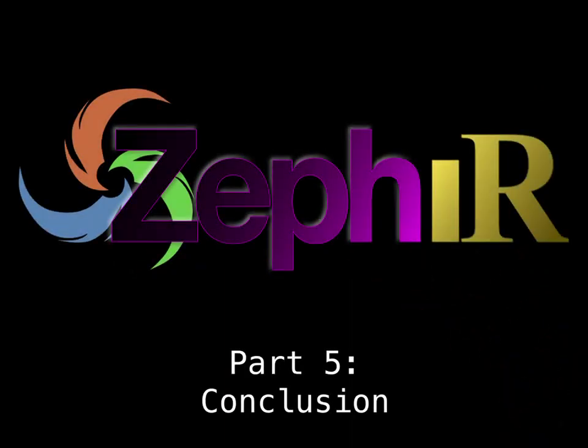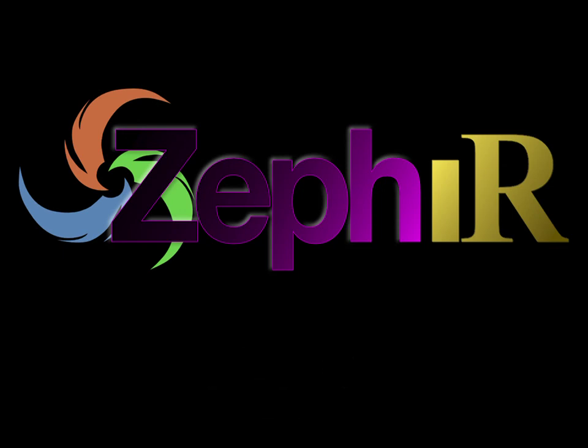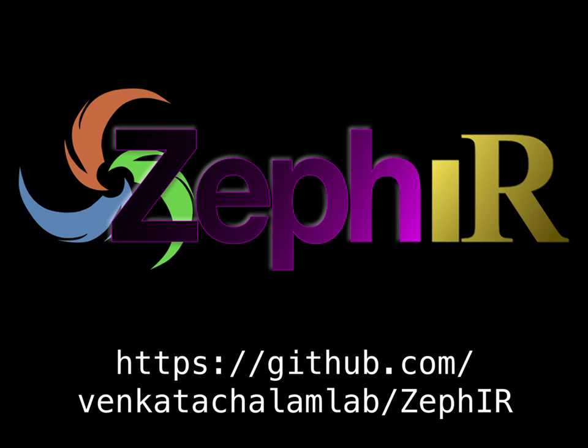For any of the steps we have gone through today, you should feel free to adapt as needed to develop a workflow that works for you. If you run into any issues, please submit an issue on GitHub or contact us. We're happy to work with you to get Zephir working for your datasets.